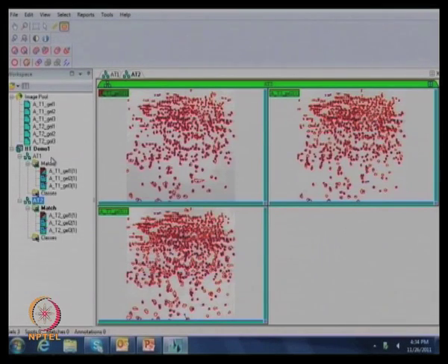Now one can analyze in the class analysis, between these two classes, like interclass and intra-class. Between a control and treatment group, one can now do the statistical analysis. So now I am creating the classes here. Otherwise, before that I would like to go to one report point.